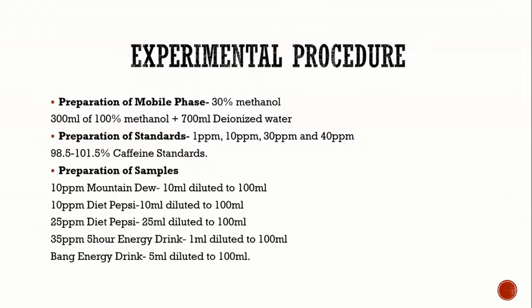For the preparation of our standards, we dissolved about 0.25 grams of pure caffeine in distilled water to make 1 ppm, 10 ppm, 30 ppm, and 40 ppm of caffeine standards.